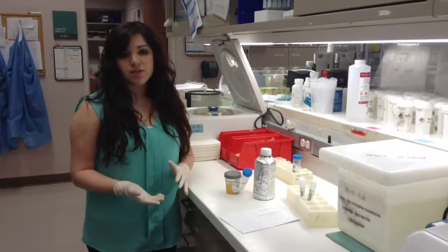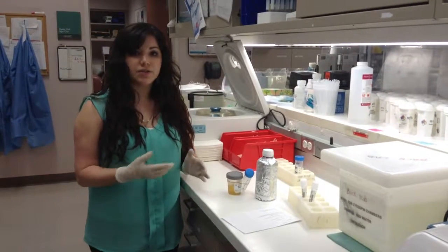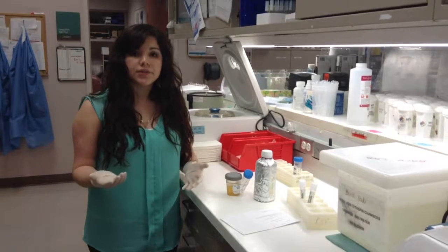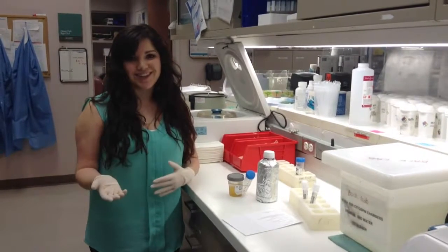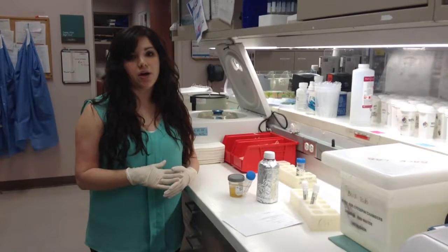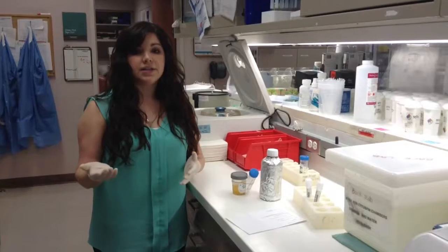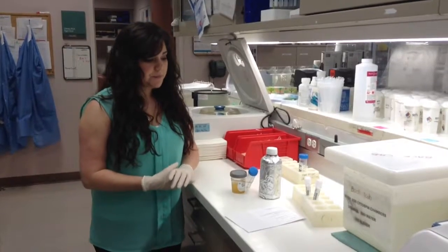So these are some reasons why we don't smear these cases. You'll want to fully explain that to the student to make sure they understand the importance of smearing versus not smearing, and how to think through each specimen they process and be able to provide the highest quality slide for the pathologist to look at.